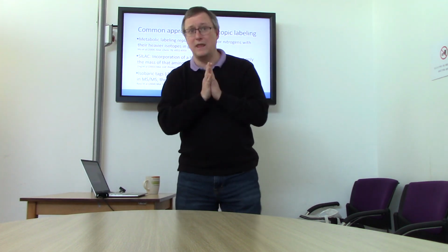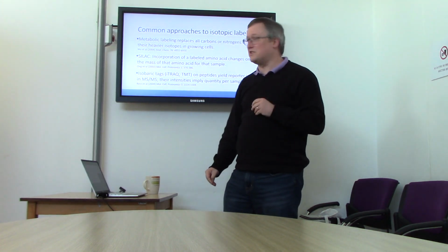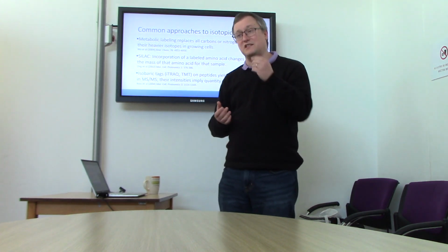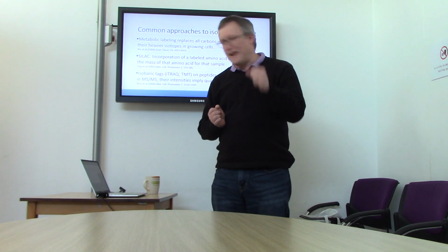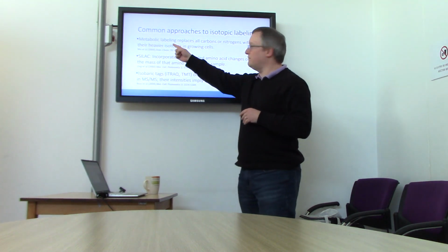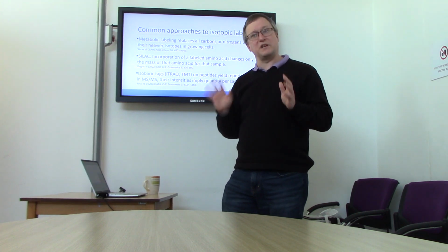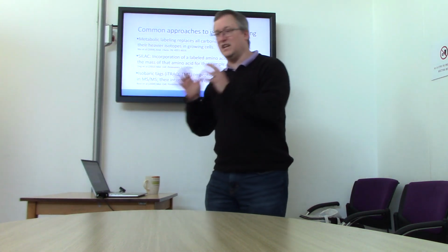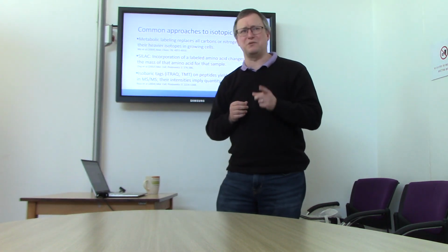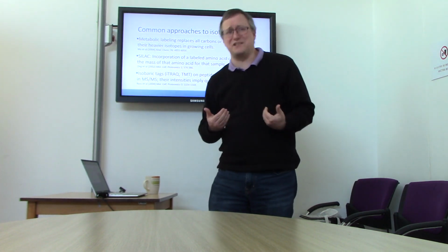All fair? All right. So metabolic labeling is one of the earliest approaches that we have seen used in this, and it really relies on the fact that you're growing cells of your samples, and these cells can be grown in a way that ensures that every nitrogen is heavy, or that every carbon is heavy, whatever you're doing. So you need to have some way of metabolically labeling these creatures so that they do that. So I think most of us would accept that for many species it's possible to do this sort of total labeling, but you wouldn't really want to try it in a eukaryote, would you? It's a little more challenging to think about heavy labeling a rat, for example.